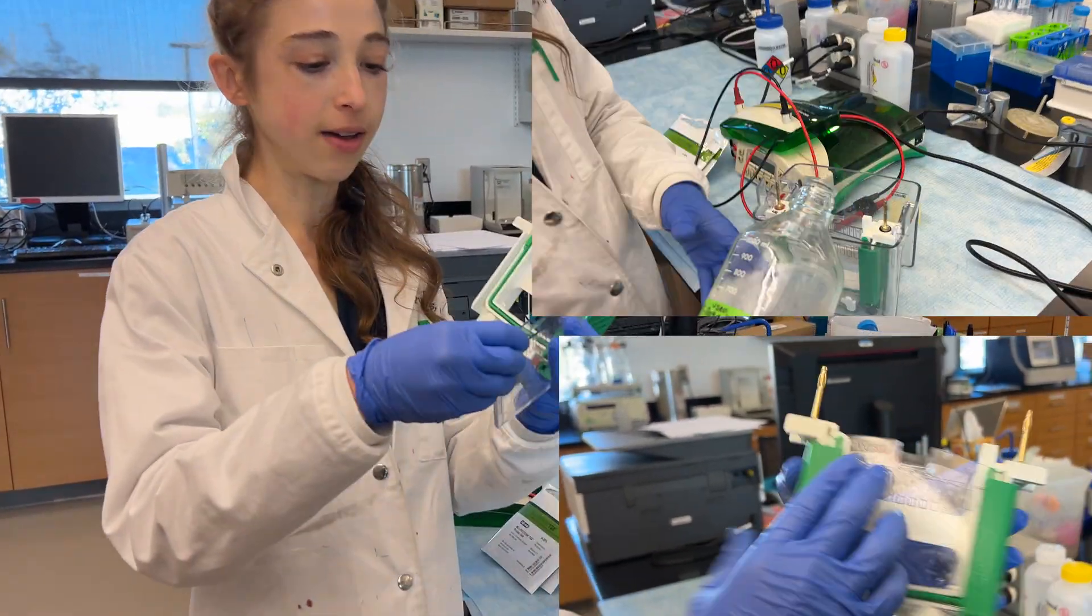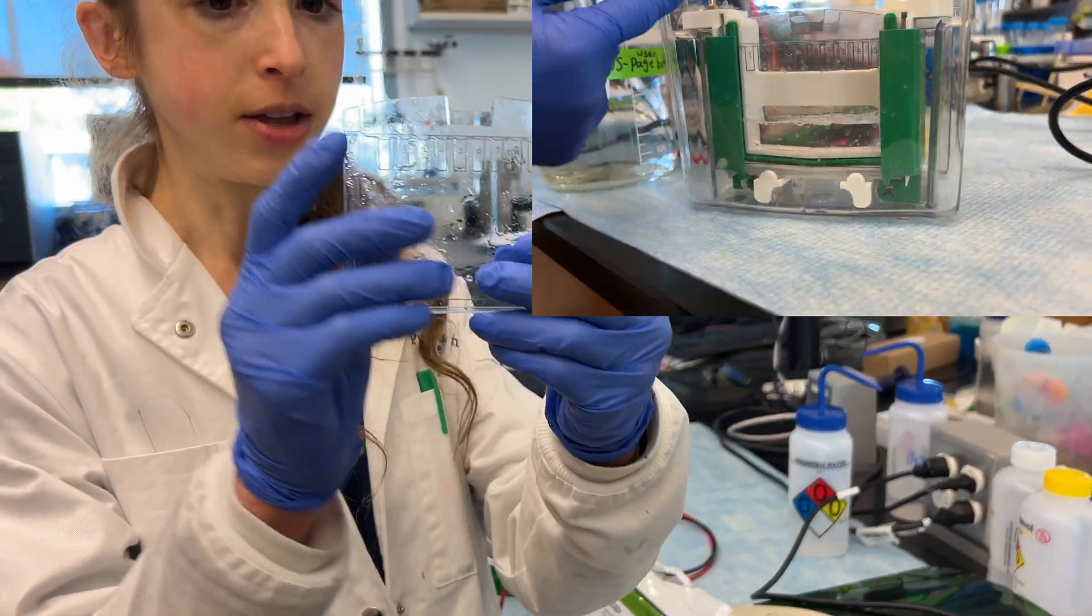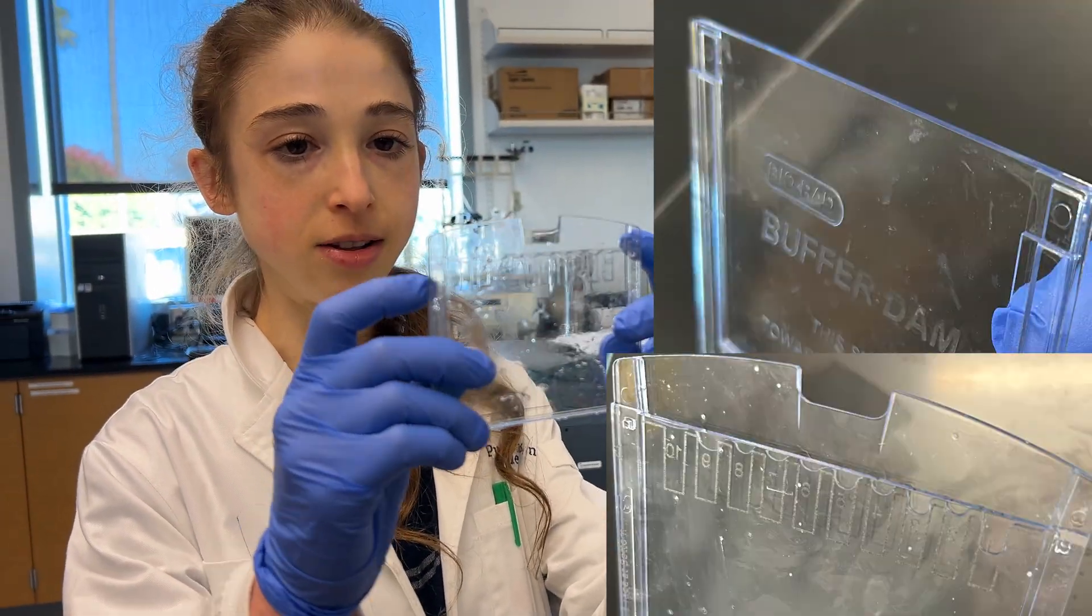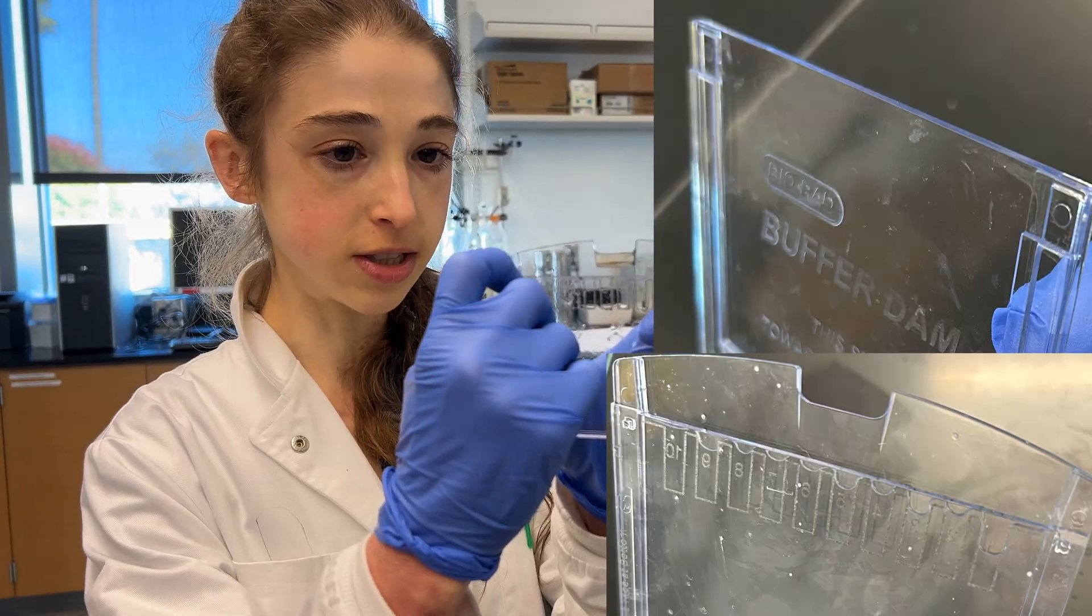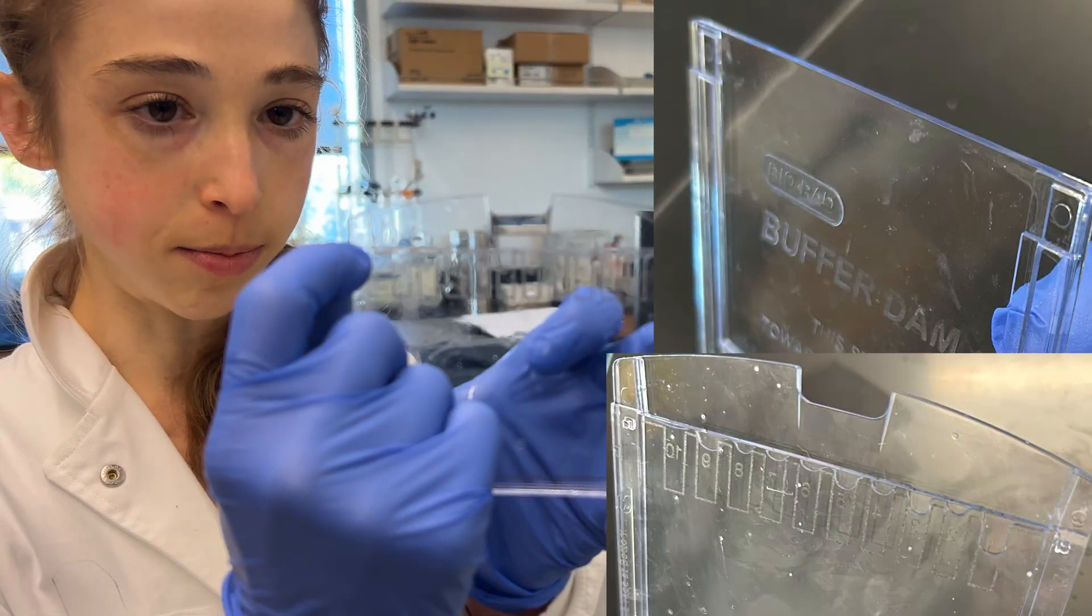So when you have your gel cassette or your buffer dam, you'll see that one side is going to be tall and then the other side is going to be short. The top of this short part needs to be flush with the bottom of the rubber part.